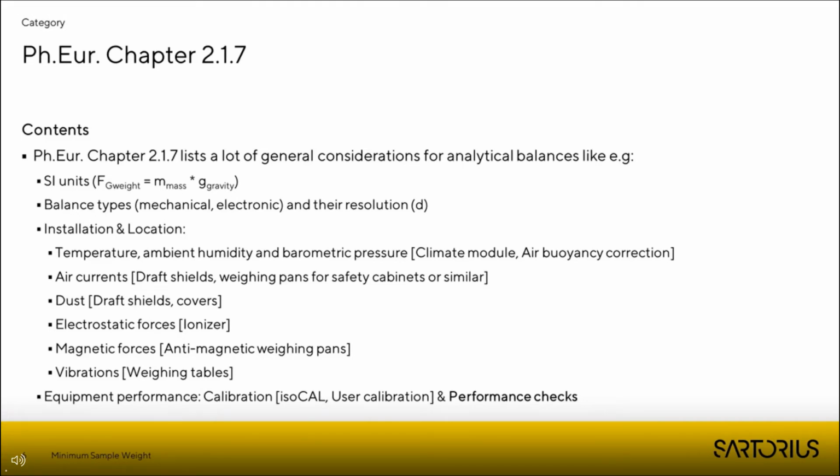The new chapter gives clear guidance how to monitor environmental conditions at the installation site, like temperature, humidity, and barometric pressure, and gives recommendations how to avoid air currents, dust, electrostatic forces, magnetic forces, and vibrations.